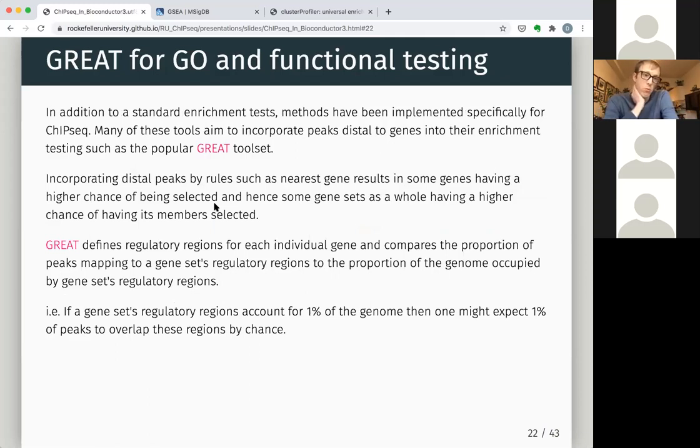And so this is getting at Sadie's question from earlier a little bit, where so far we've just annotated with closest genes, and that can obviously be limiting because oftentimes peaks or transcription factors can bind to a certain place and regulate, if there's some kind of TAD there, it can regulate any gene within that regulatory region, or maybe it skips over the closest and regulates the next one.